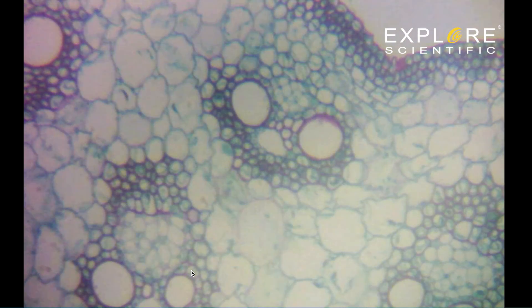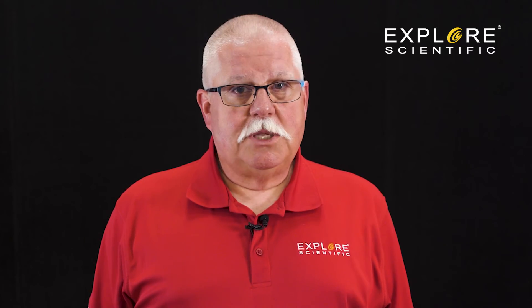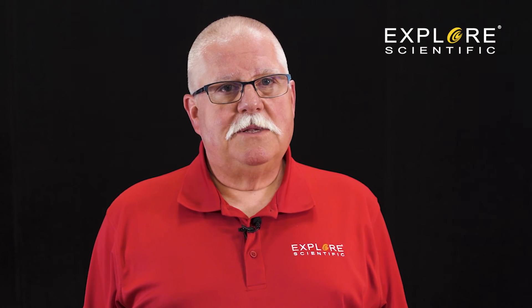Each time a new lens is turned into place, the microscope will have to be focused again. Just like everything else, the more you practice, the better you become.